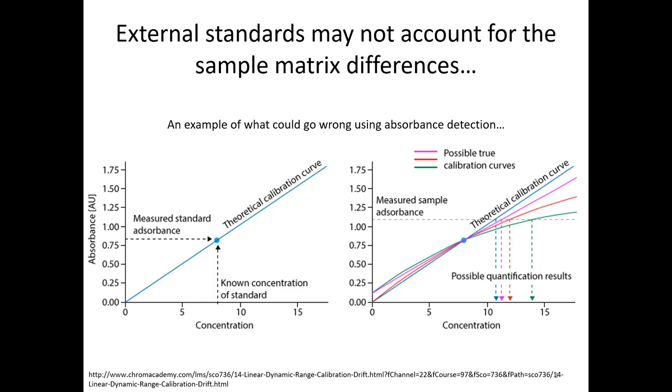And this is an example using absorbance, again, but a lot of the issues that are observed there are similar with mass spectrometry. We can still see the saturation at the top and hope for as straight a line as possible, but many times it doesn't happen.